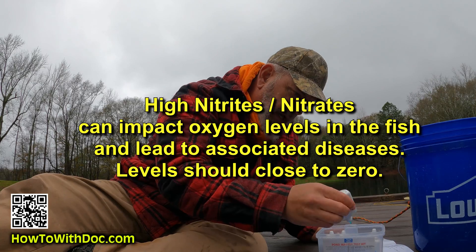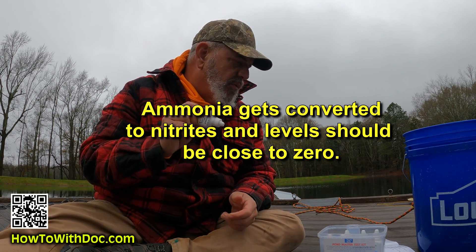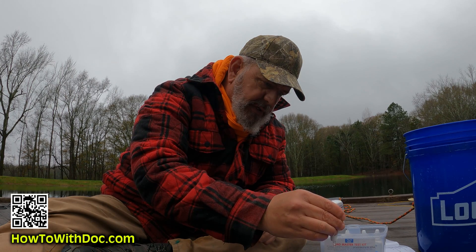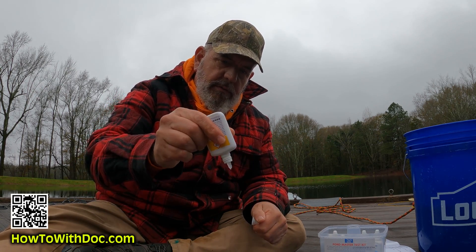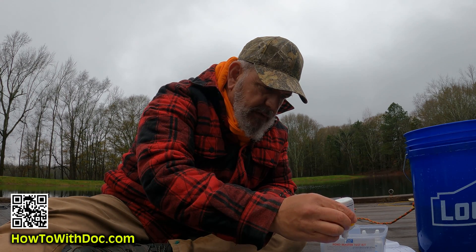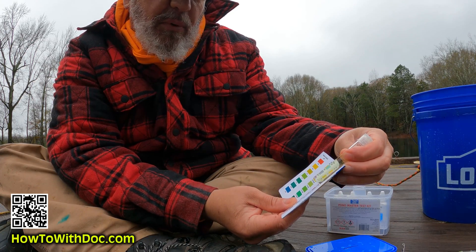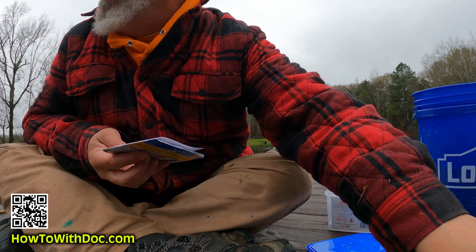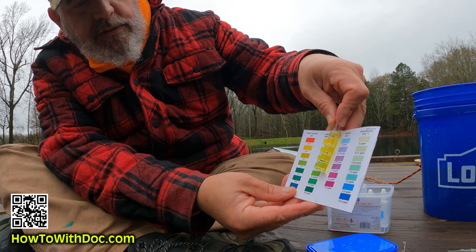Now I'm doing nitrite — five drops — and then ammonia: eight drops of bottle number one and eight drops of bottle number two. Looking at my phosphate result, I'm pretty much close to zero, maybe 0.25. I'm happy with that. Looking at the ammonia, I'm also pretty much close to zero.